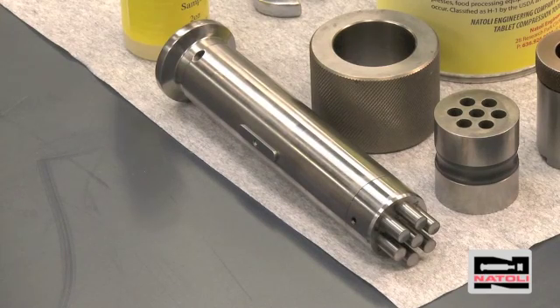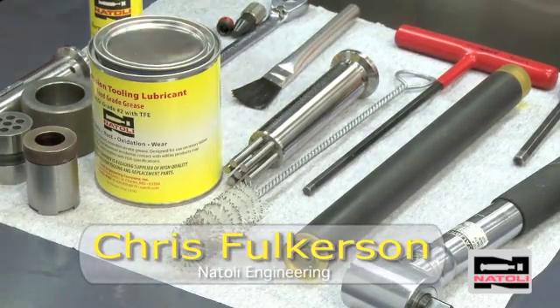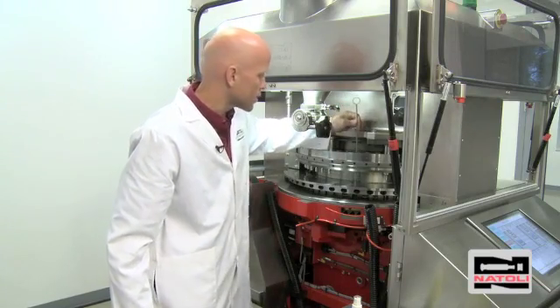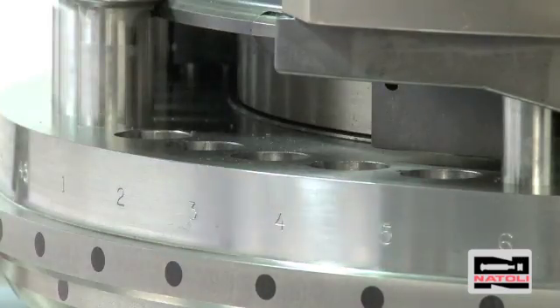Multi-tip tooling is a little more challenging to load because the punch and die bore have to line up precisely. The first step is to clean the guides using a punch guide brush. We take the punch guide brush through the punch guides to clean all debris and dirt out of there. This allows your lubrication to stay clean and allows for a cleaner running press.